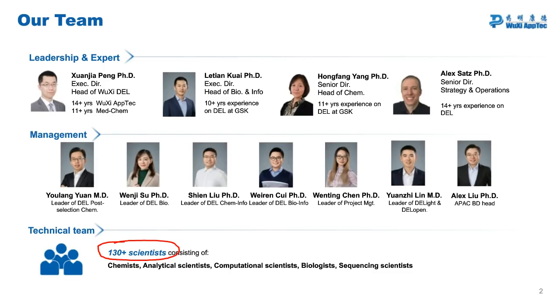Can you do it if you've never run a screen? The answer is yes. Our view is that people accustomed to working in a lab can read the protocols that we have, watch the video that we've posted, and that yes, they should be able to most likely run these screens.